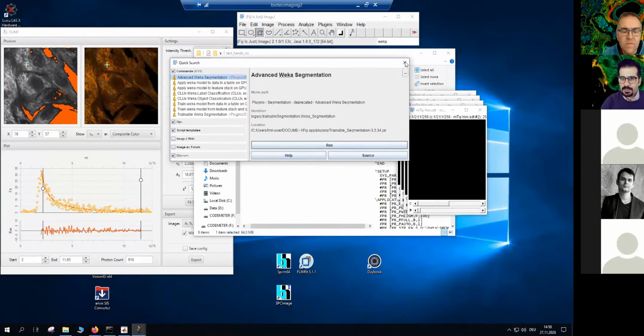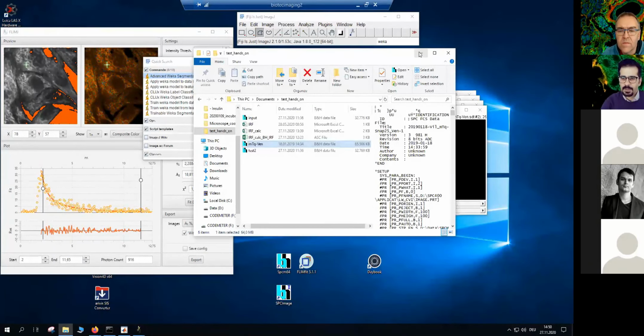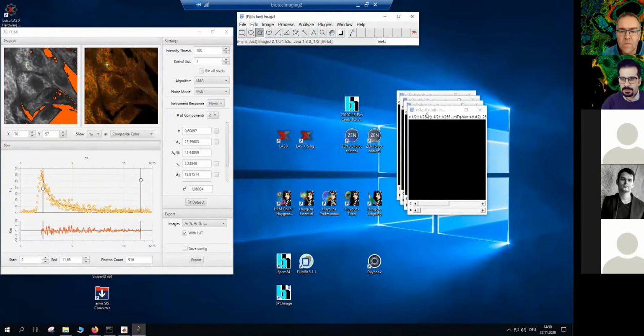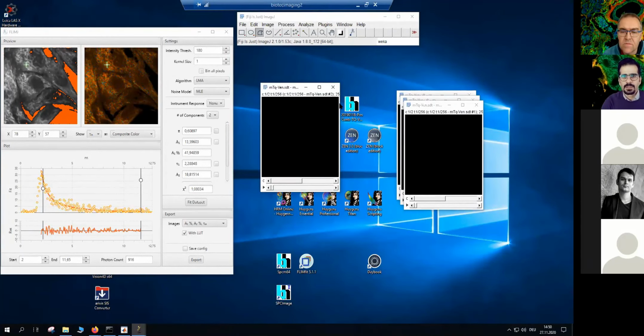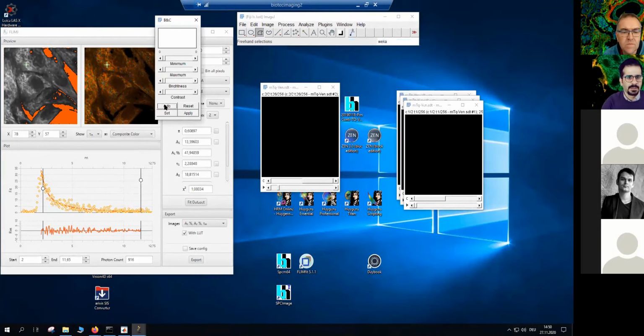Okay, let's close it. So these are my images. And close this one as well. Here they are. So that's one of them. There are 4 actually. I just need to go somewhere to find my sample. It's exactly the same thing. So I just go for adjusting the brightness, and here it is.